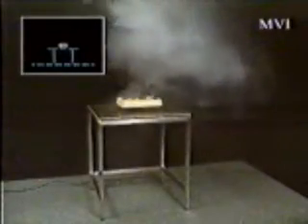Let's look at the additional effect that heat will create. Heated components exist in many cleanrooms, and here are two examples. First, a hot plate with a 1 kilowatt capacity was heated to 160 degrees Celsius. In the first instance, it was placed on a work surface close to the wall. The turbulence is clearly demonstrated, and the potential contamination, not only from the heating unit, but also the work being undertaken on it, may contaminate items close by. Moving the plate from the wall has only a marginal effect, but given time, the room's airflow will accommodate the thermal effect.